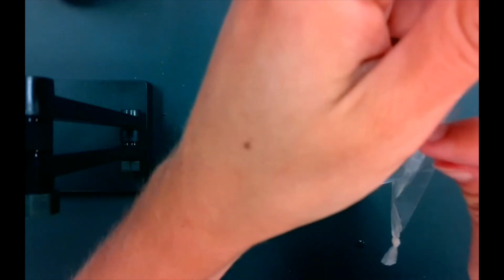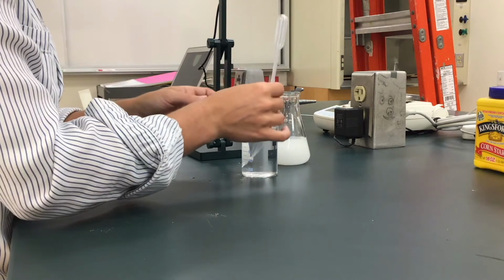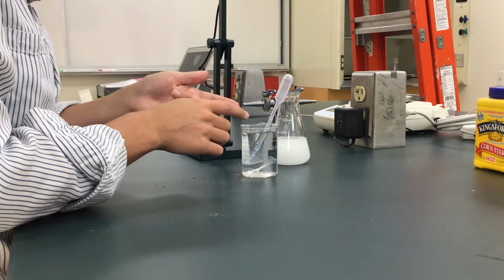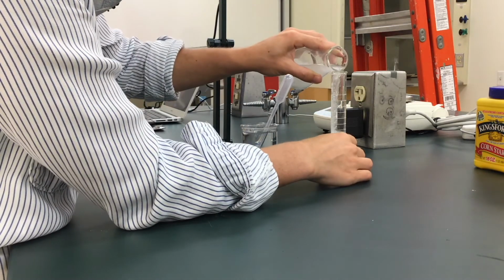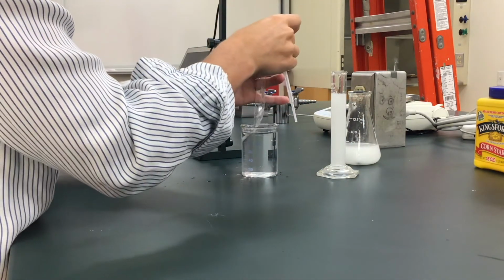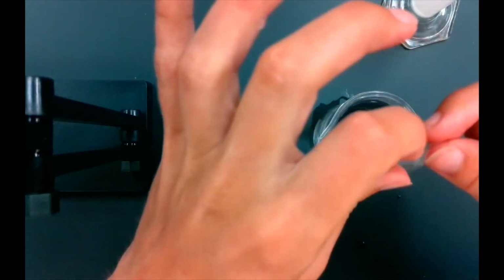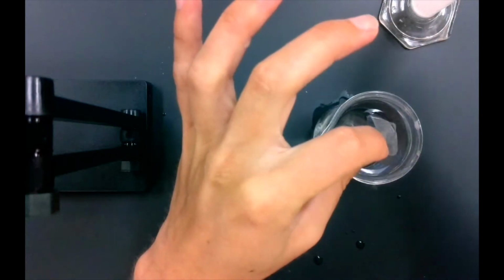Great, perfect. So I'm going to measure a small volume of our solution that we prepared using a small graduated cylinder. And then I'm going to pipette that volume into our bag, and then I'm going to take the mass. Now I want to get that volume into here. So what I'm actually going to do is pipette directly into this bag because it's sort of the easiest way to get the volume into the dialysis tubing, which is a little bit tricky.